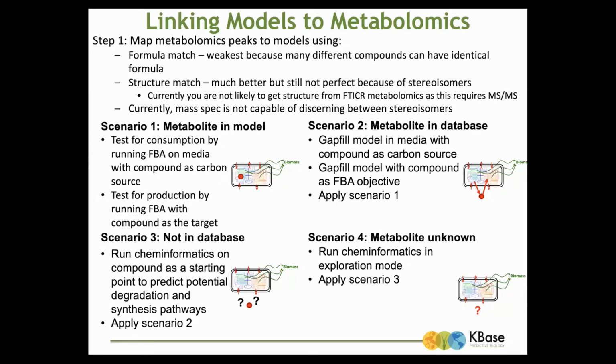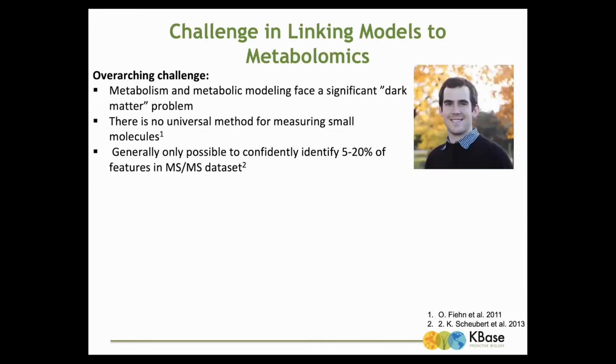So what you saw in day 2 was sort of non-mechanistic formula-derived analysis. And there's a lot of very powerful things you can do with that. What we're going to talk about here is, okay, can we mechanistically understand why those formula are there? And again, this is where your FTICR data is, formula scenario 4.